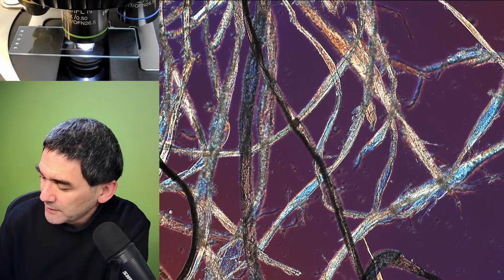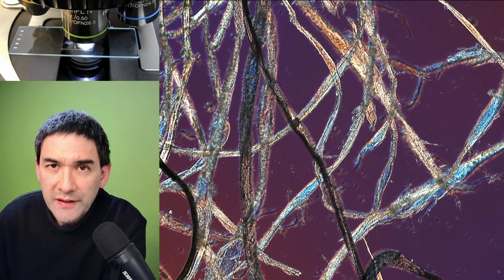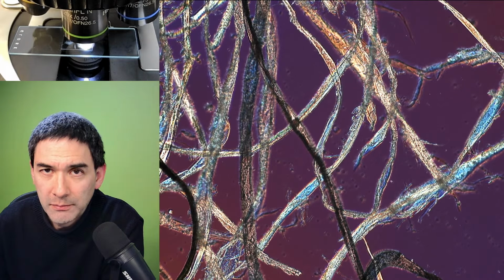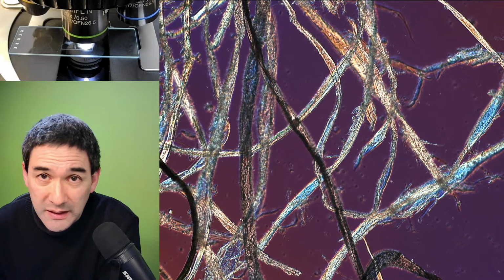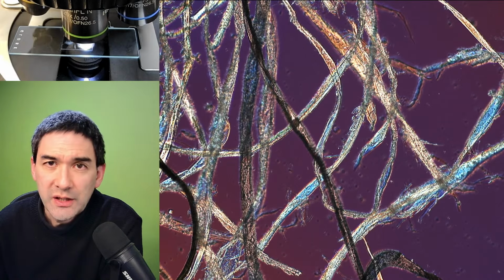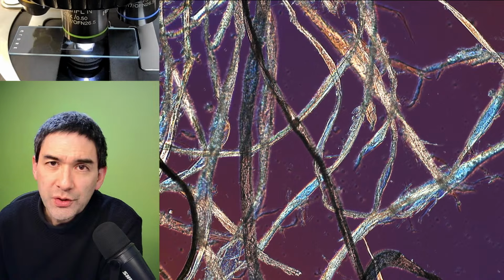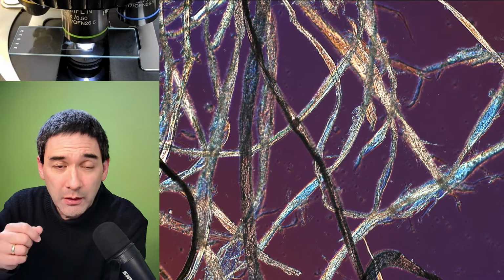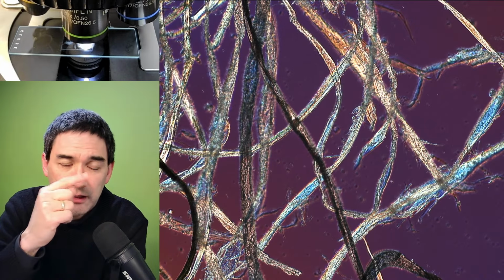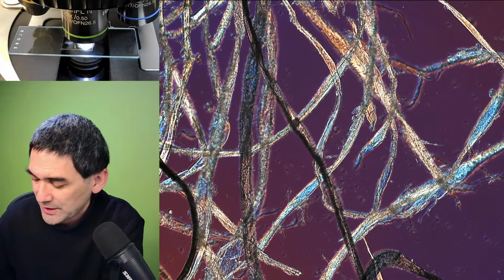How can you find out if some fibers are natural or synthetic? Very briefly, the synthetic ones, I mean plastics like polyester, nylon, and so on. The melting test is one thing, and there are also special stains that you can use. And very often synthetic fibers are not so irregular. So this one is very irregular, so they're mostly natural, I would say.